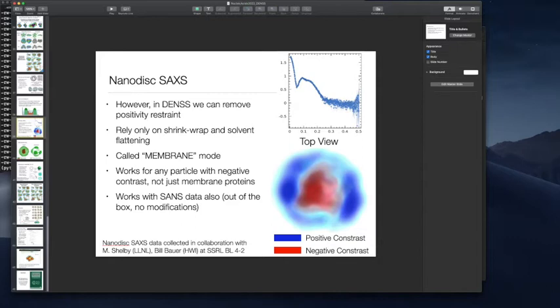I'm thinking about this from the perspective of how mass spectrometry is used for some applications in trying to diagnose samples. That is the reason I asked about gram-negative bacteria: would something similar be possible in a high throughput fashion with this? I think the big issue there is sample delivery. How do you deliver that particle and match, for example, the beam size to the particle size? The experimental limitations become much more important there, since it's so atypical.